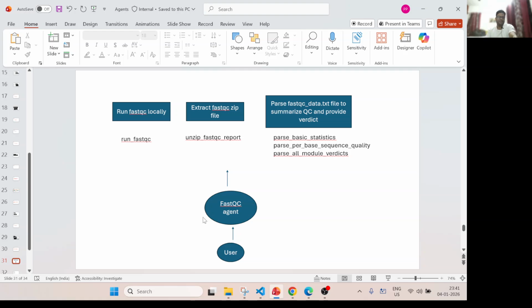That's what I liked, the agentic AI kind of development that we see. That's all I had in this use case, but yes, you can improve this with more QC parameters, as I said. This was just to give you some idea of how you can convert your existing knowledge about tools to a different new flavor of workflow.